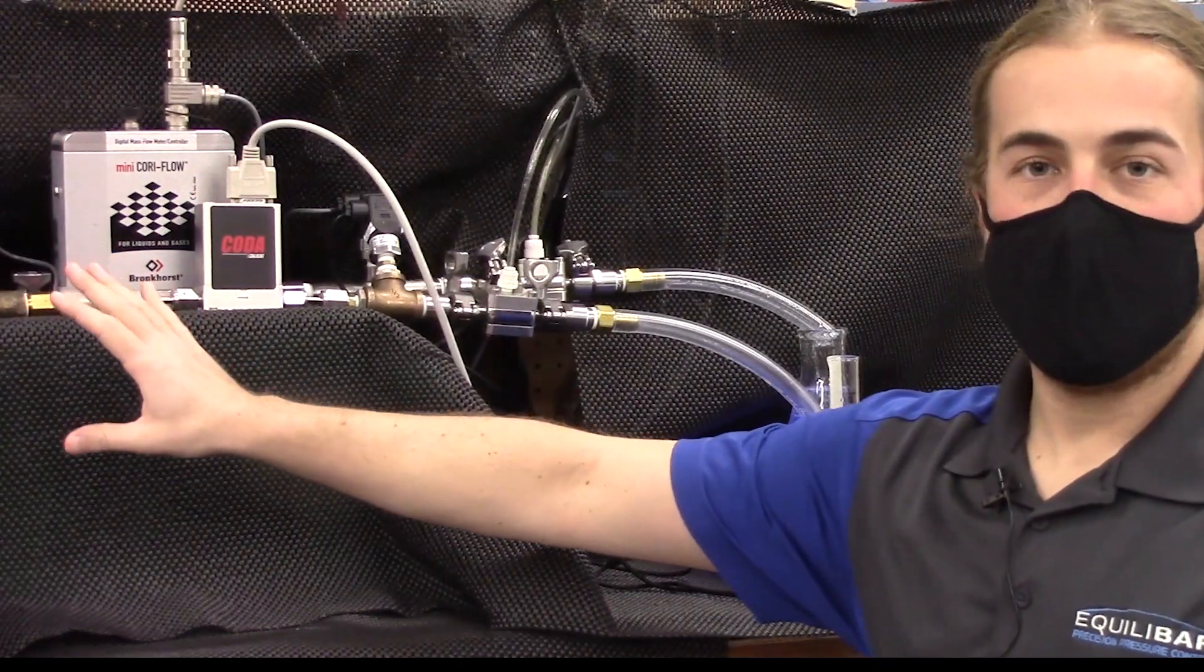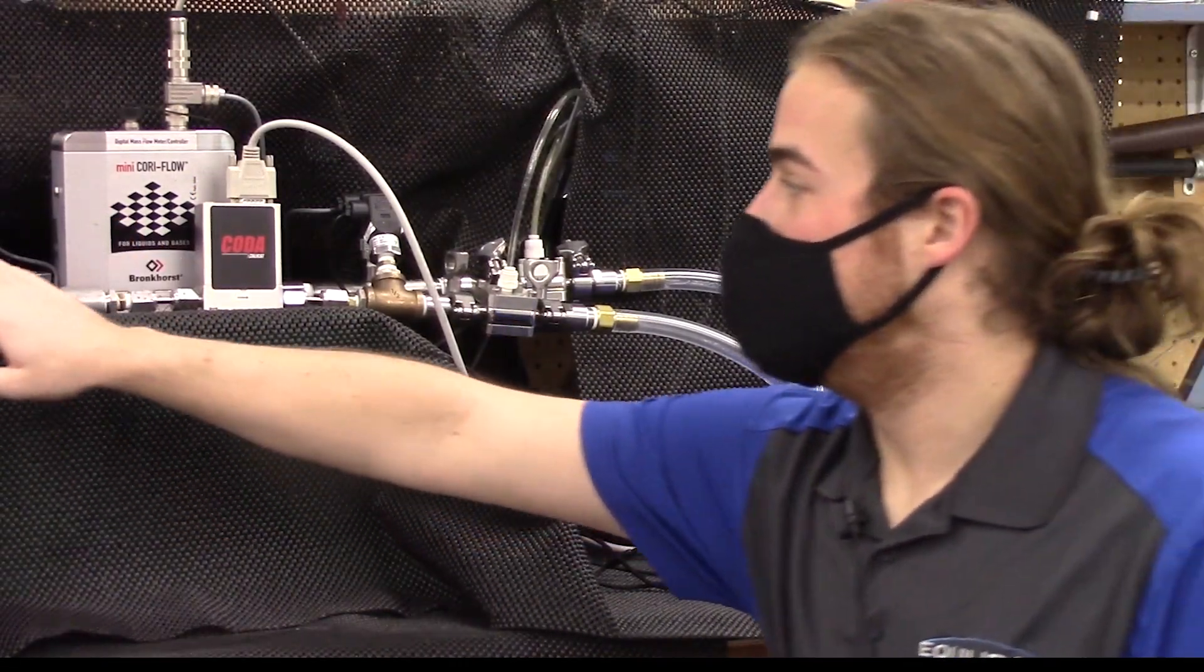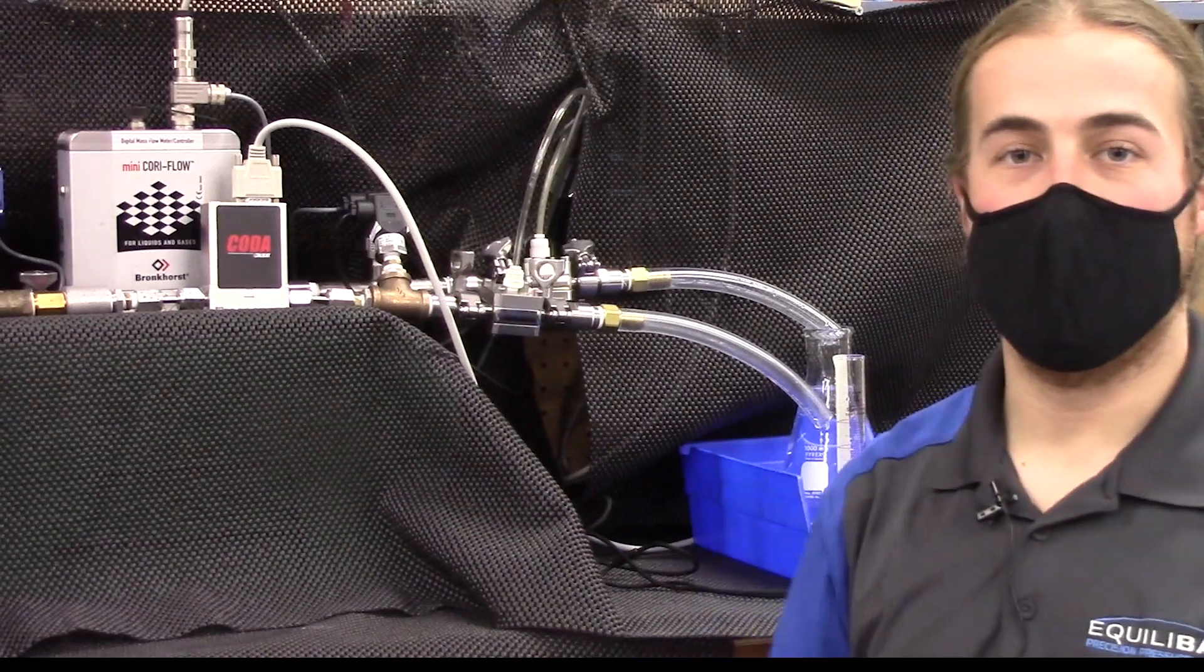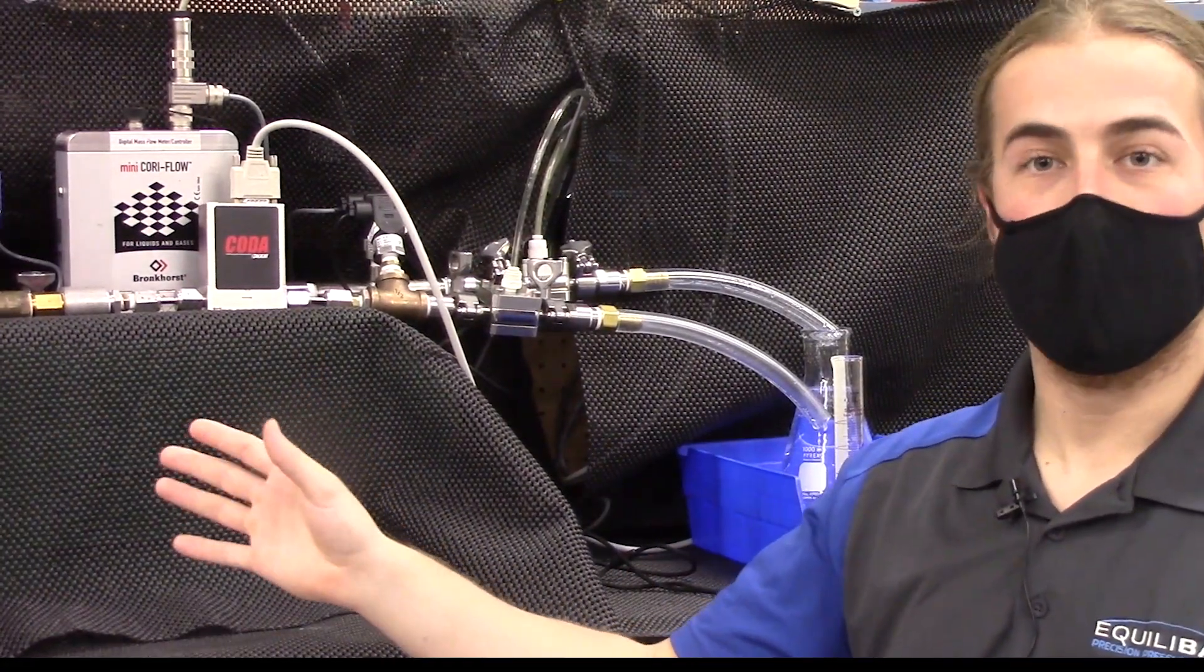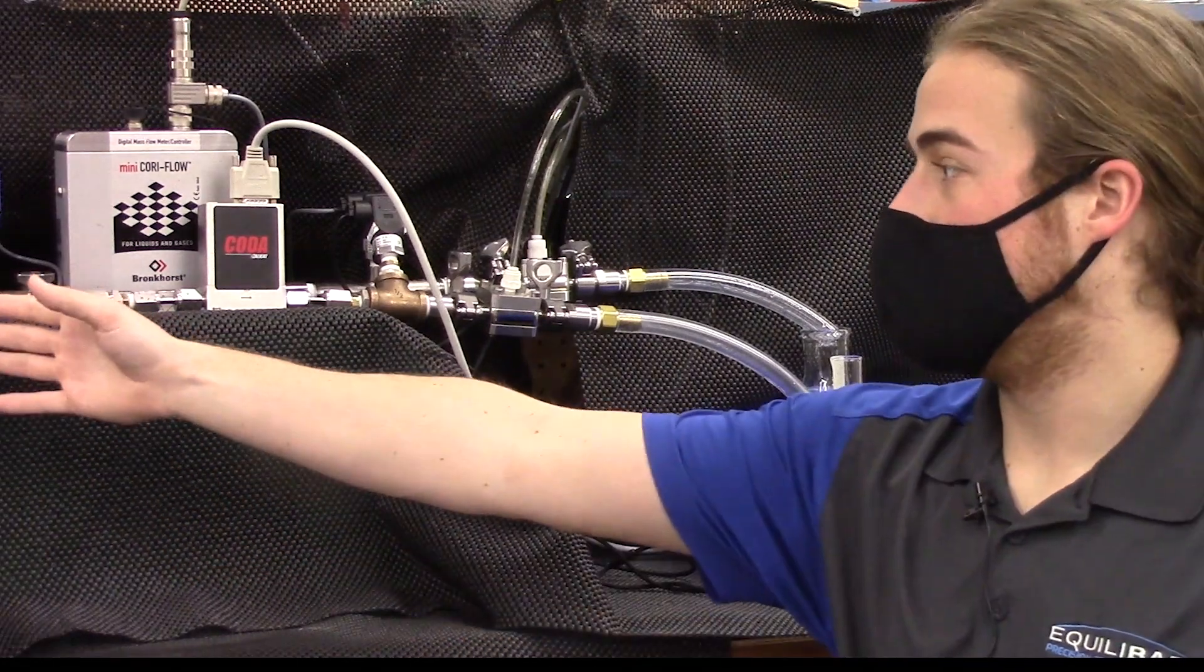So here is our setup in the lab. Just like the schematic here, we have two independent lines that are being supplied by head pressure driven flow systems. In this case, we're supplying roughly 15 psi to our upstream side here.